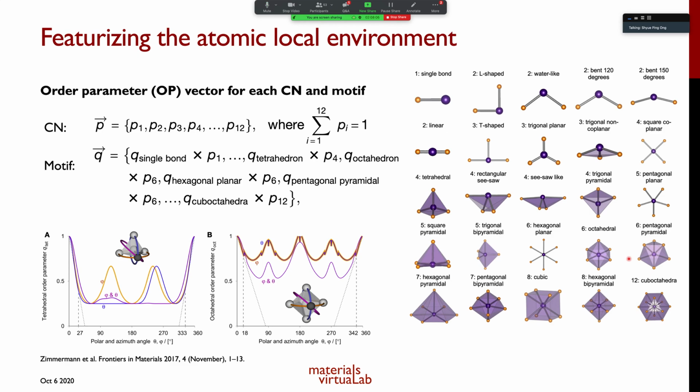And there is sort of no in between to it, right? So even something that may be a very distorted octahedral that already looks close to being a square pyramidal, sometimes we still think of it as an octahedral. So what we wanted to do is to relax that constraint a little bit. Rather than classifying things as just coordination number 4 or coordination number 6, we wanted a more rigorous and subtle way of describing the local environments.